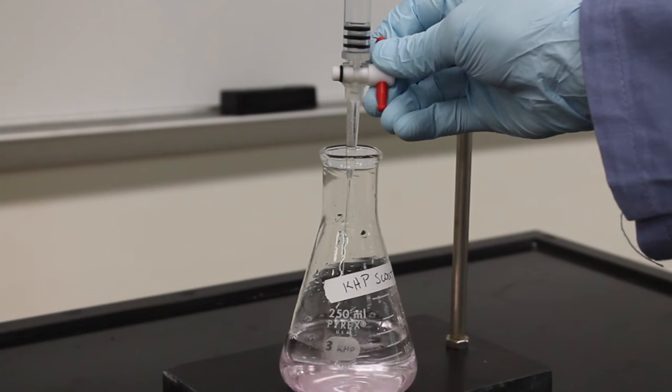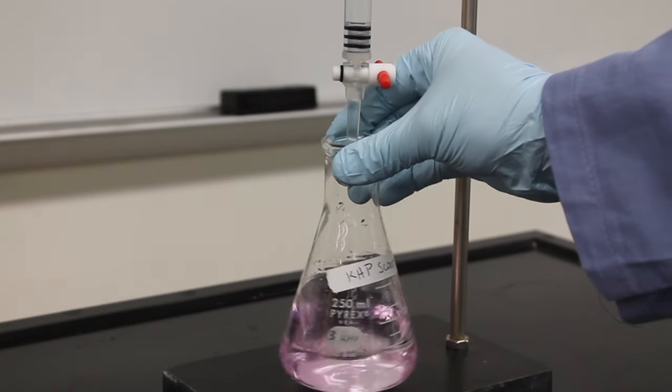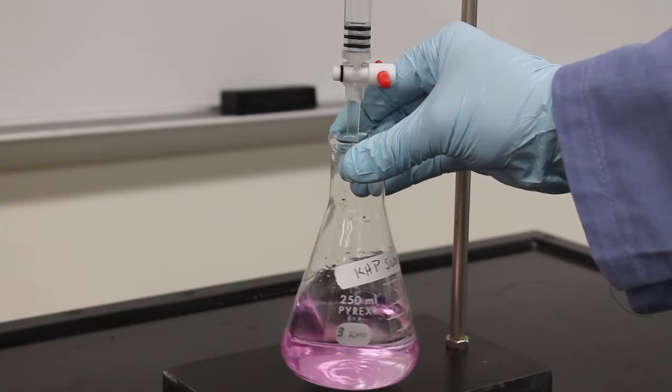The masses don't need to be equal, but they should be within 25mg of each other. Here my scout titration tells me that I need approximately 15.5ml of NaOH for each of my solutions.